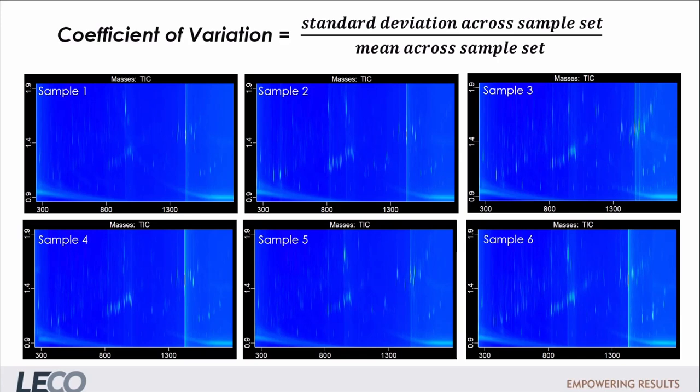It's an unsupervised comparison, so it'll highlight any variation within the data. It tends to work well for experiments where any type of difference or trend is potentially of interest. It's also done without assigning samples to classes, so it's a good option if sample groups are unknown or if there aren't clear sample classes in the experiment.